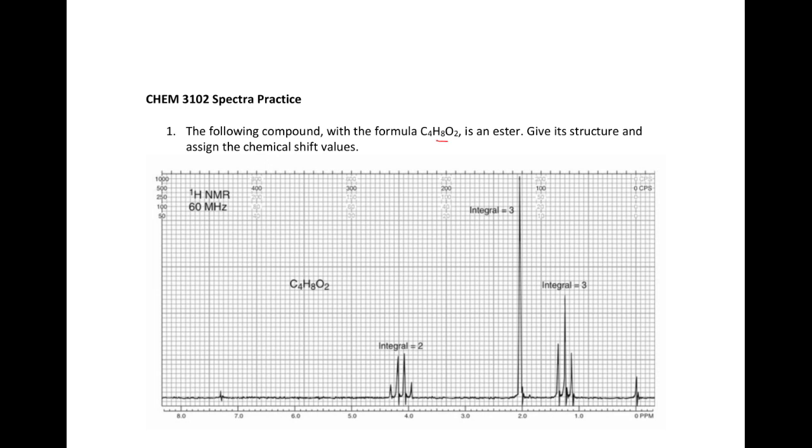What is my HDI? For this compound, you plug the numbers into the formula, or you just remember it. Anyhow, the HDI is 1, so there's only one double bond in here, and since we know it's an ester, we have this moiety, this functional group, the ester, and we must have a couple of R groups coming off of that. So let's just remove the R groups for now. We'll take those off. There we go, and we'll take a look at our spectrum, because we know we have an ester, and we've already taken care of the HDI.